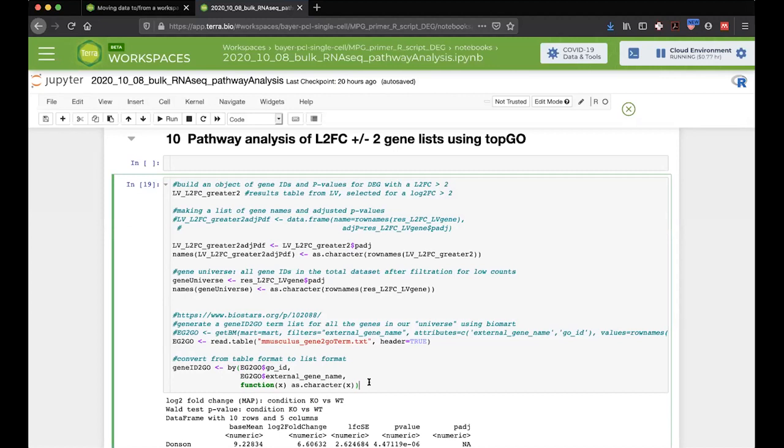So my favorite pathway analysis databases are the gene ontology databases, just because I find them to be sometimes quite obscure, but I find that using sources like AmiGO to examine genes in a pathway is very useful. So I'm going to start executing this, and then I'll walk you through what I'm doing. First, we're just printing the results table, which is really short, with a log2 fold change of greater than 2. So we're just looking at that for right now. But again, it's a short list.